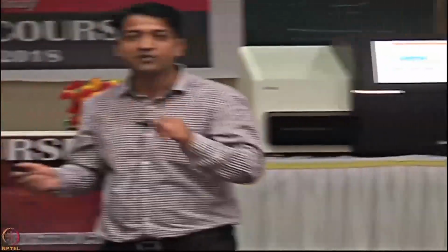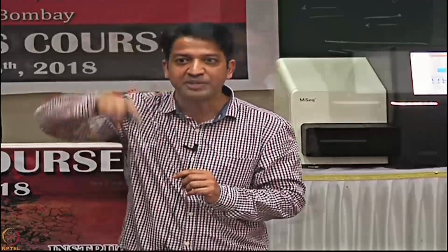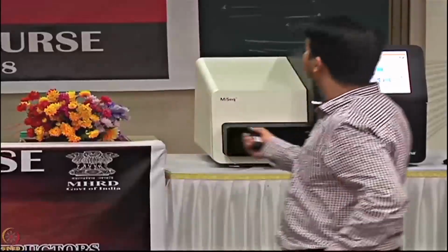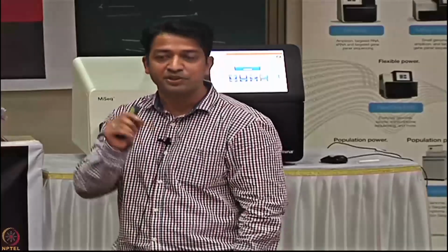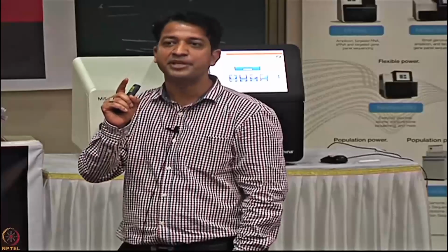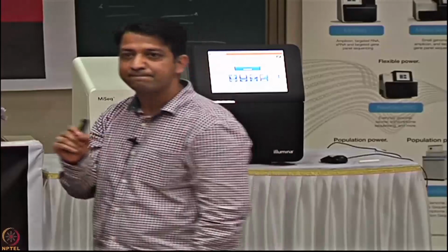So in terms of NGS, in Sanger, how do you detect the quality of the data? By looking at the peak. If the peaks are sharp, your call is good. In the case of NGS, we define the quality in terms of Q values, quality values. Illumina uses Q30 scores. A Q30 score means 1 error in 1000 base pairs added, so the accuracy rate is 99.9%. Okay.